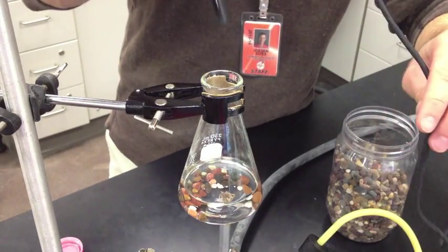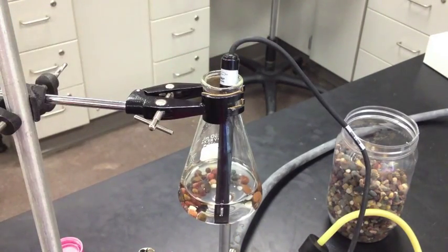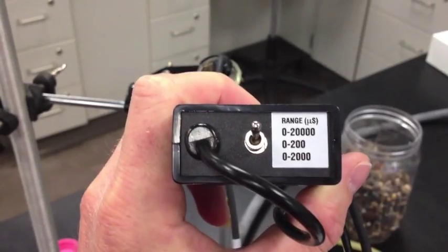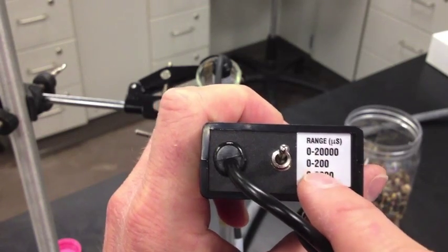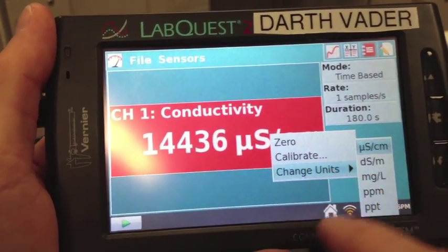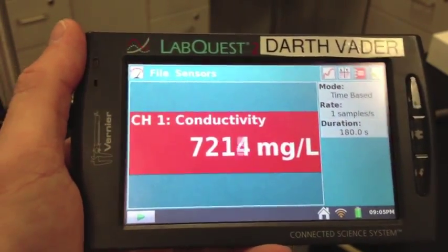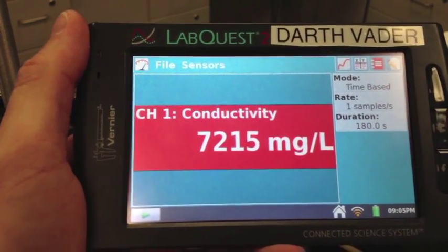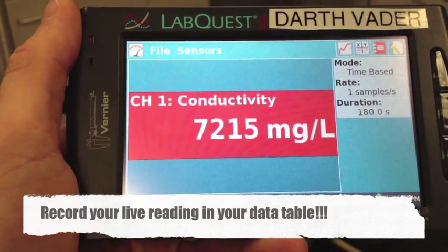Place the rinsed conductivity probe directly into the saltwater, making sure the tip is completely submerged — tilt the container if needed so it's fully submerged. Make sure the toggle switch on the conductivity probe is on the 0 to 20,000 reading, since saltwater will have a high reading. On the LabQuest, change the units to milligrams per liter. I made this saltwater at 8 grams per liter, which is 8,000 milligrams per liter. It's reading 7,215 — that's pretty accurate. Simply record the live readout in your data table, so I would write 7,215 milligrams per liter.